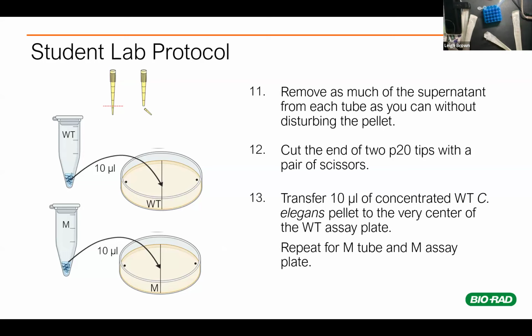Yep, 3. And this step is one I have some teachers do and not do, which is remove the buffer on the last wash, because ultimately we're just going to go down and pull worms off the bottom. If you love to cut out steps, you could skip it and just go to the bottom. But the caveat is I found with students, you need ones that are high performers, because otherwise a lot of times they'll make the worm pool happen and you'll get a dilution of worms that end up on the plate. So I think it is much better to do what Bio-Rad's protocol has, which is remove that last volume of wash buffer, leaving behind just that pellet in the bottom of each one of those tubes.